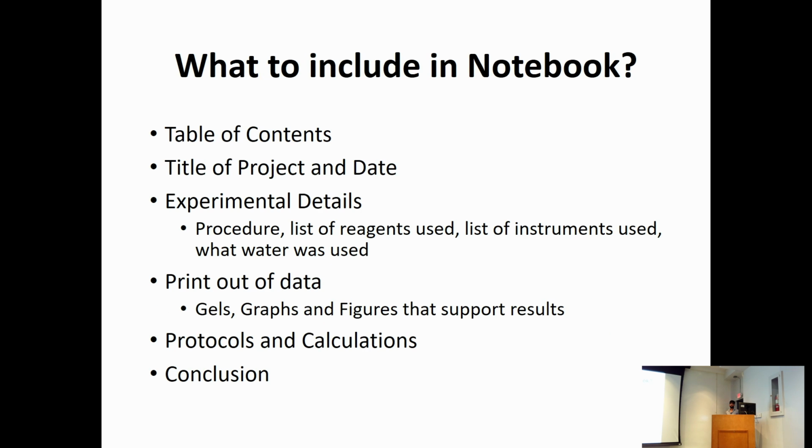Whenever you start working on a lab notebook, if you have a physical one, the first couple of pages are for the table of contents. That is the standard way a lab notebook is set up. If you are not using a standard one, you can leave the first couple of pages to use as the table of contents.